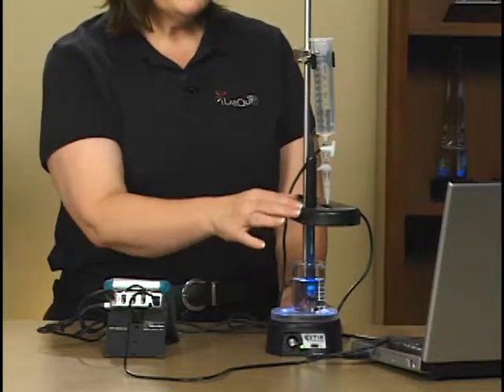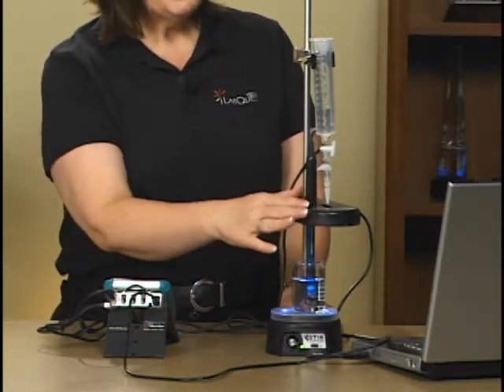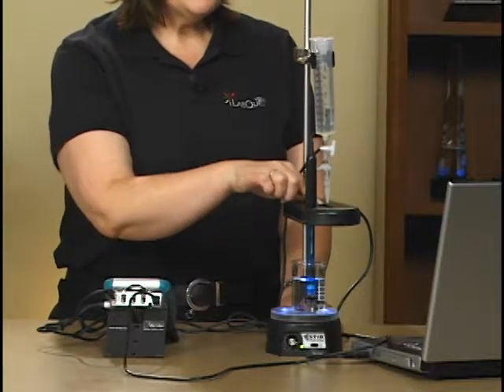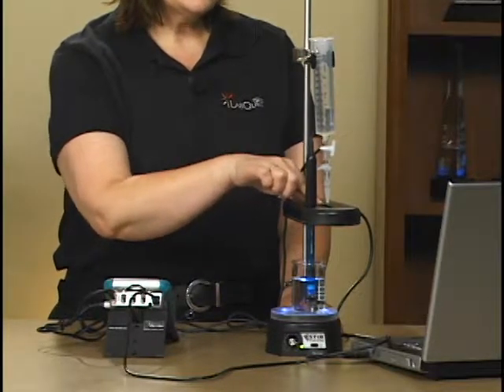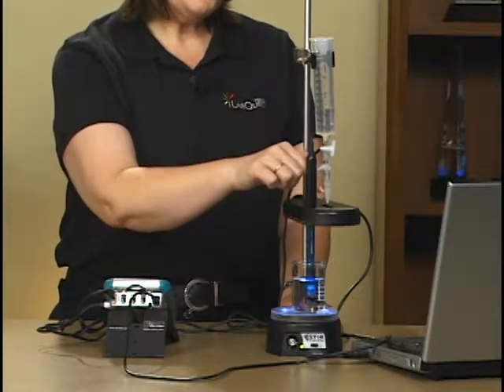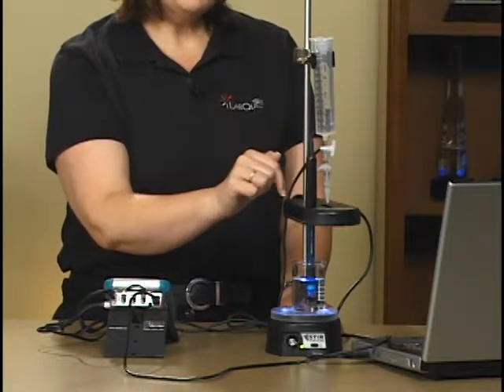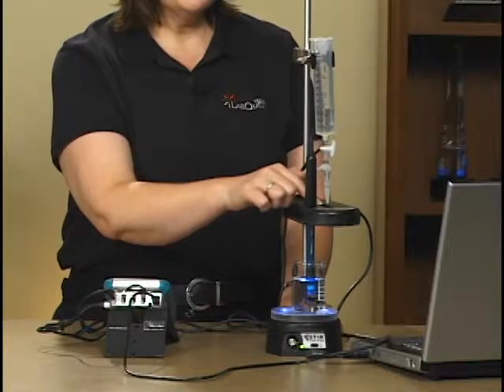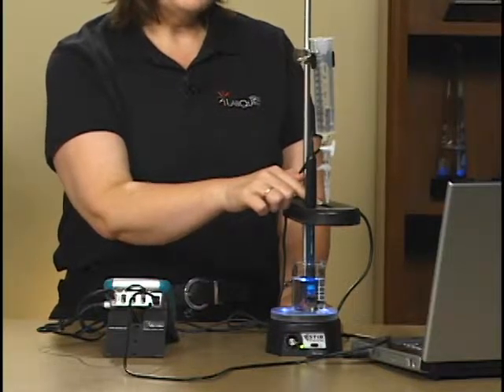The drop counter itself is made of two pieces. This part is the part that actually counts the drops. An infrared beam of light goes through this little slot on the top, and as the reagent reservoir here drops drops through the slot, they will break the beam and count each drop. The software will then convert those drops into volume in milliliters.